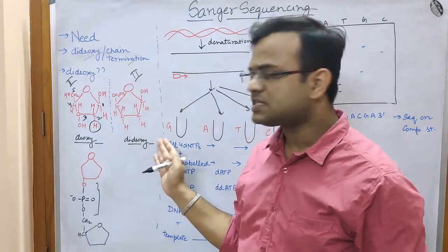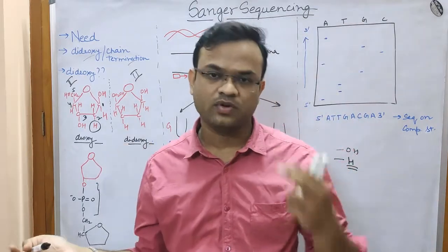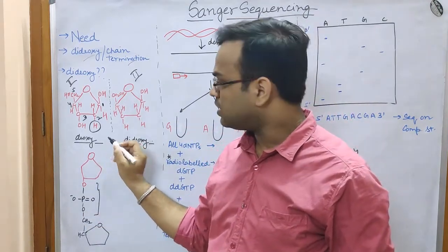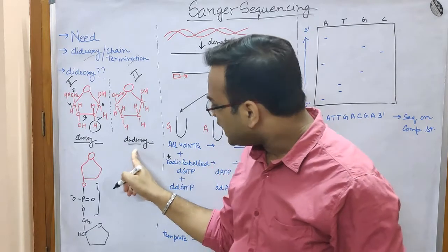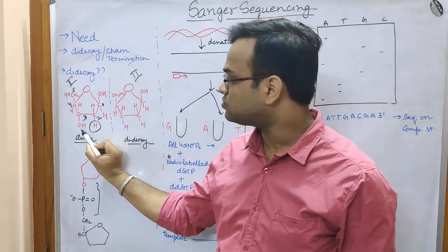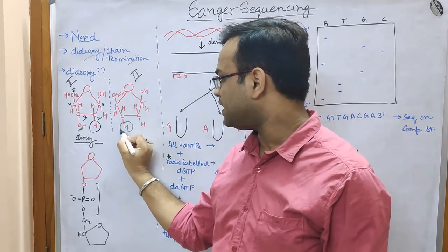In the second case, I have explained what is the meaning of dideoxy. Okay, what is the meaning of dideoxy? Here deoxy, you have got it, I guess. And dideoxy means that here also in the 3' position, the OH which was previously present is now replaced by H.